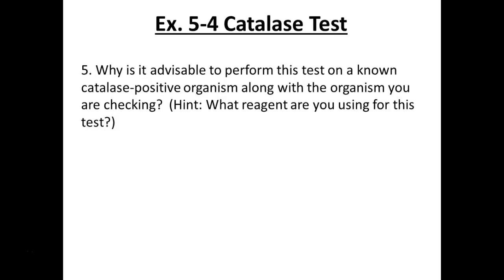Why is it advisable to perform the test on a known catalase-positive organism along with the organism you are checking? Well, this is a control, right? What could go wrong here?